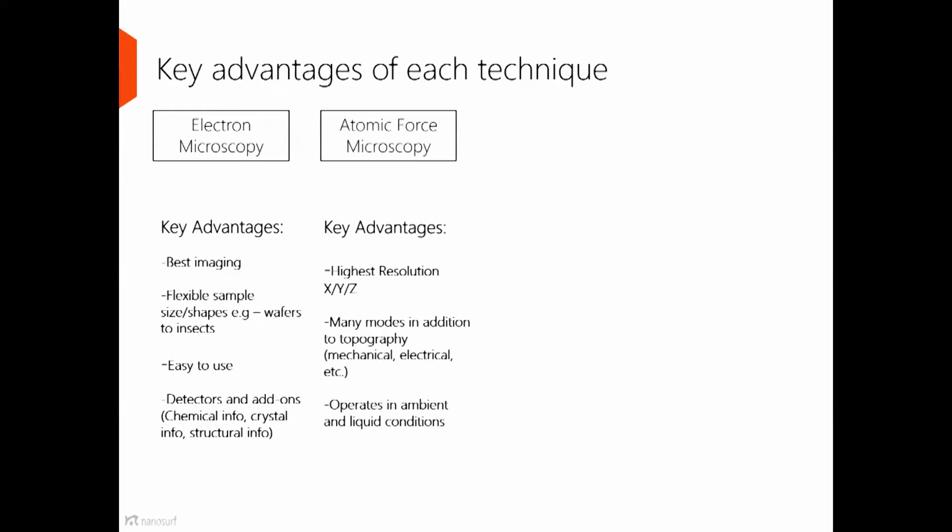AFM's key advantage is that it's by and large the highest resolution XYZ system available. It operates in ambient conditions, and it also has many modes that are available in addition to its base topography.